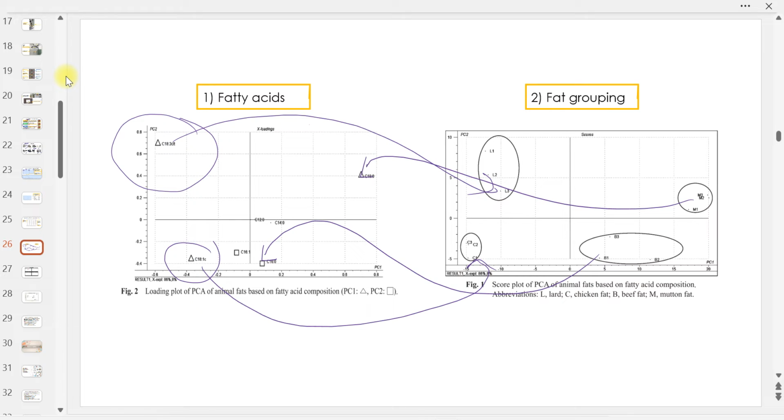Okay, so these are PCA results actually. But this one is not from my research. It's coming from other people, where actually I disagree, because you can see how many samples they took. They took only 3 replicates. If you do KMO, definitely less than 0.5. So it's not enough actually. Tapi dulu-dulu je, they published Q1, 6 sampel je.